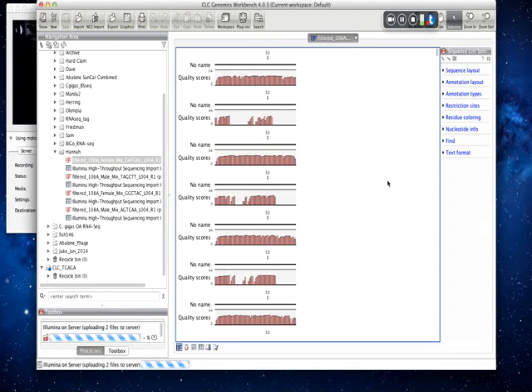We want to show you how to do an RNA-seq. So these, as we mentioned in class, we just want to map back to a backbone or a scaffold or a transcriptome and do the counts of reads. So I want to import the transcriptome.